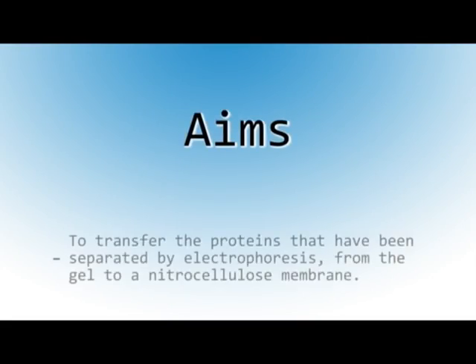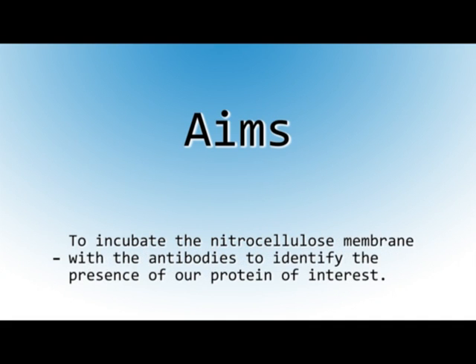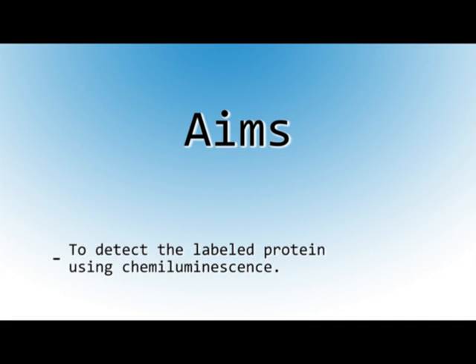The aims of this activity are to transfer the proteins that have been separated by electrophoresis from the gel to a nitrocellulose membrane, to incubate the nitrocellulose membrane with the antibodies to identify the presence of our protein of interest, and to detect the labeled protein using chemiluminescence.